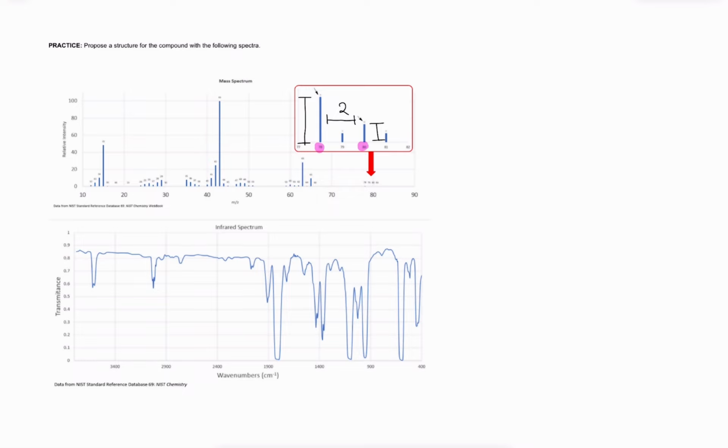In the case of M+2 peaks, we know that if they are very small, it is most likely due to oxygen 18 isotopes or having 2 heavy isotopes like carbon 13 and hydrogen 2 in one molecule. However, this is very unlikely.